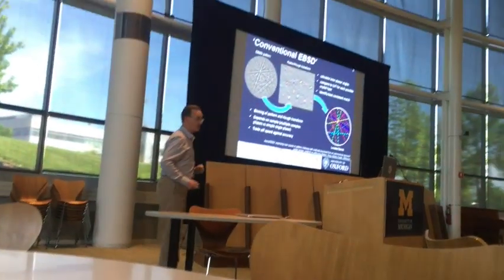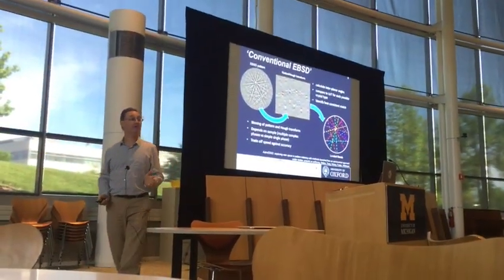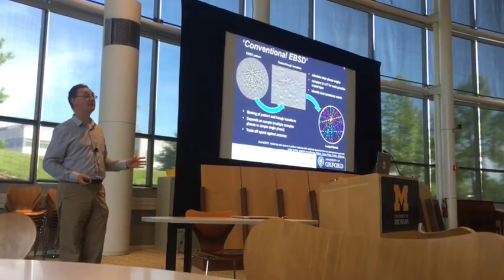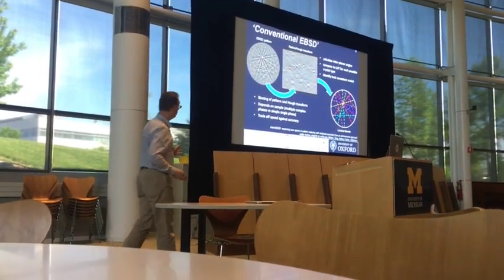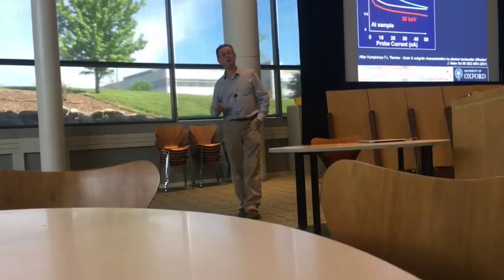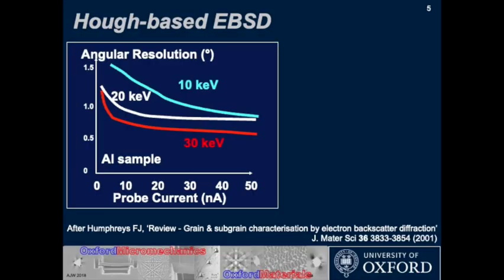You will find if you have a go with it, it's not as quick as the commercial systems, but you can look at the detail of what's going on inside it. You've got a bit more control. Currently, you integrate for a long time, get really, really clean patterns. There's a limit in the end.